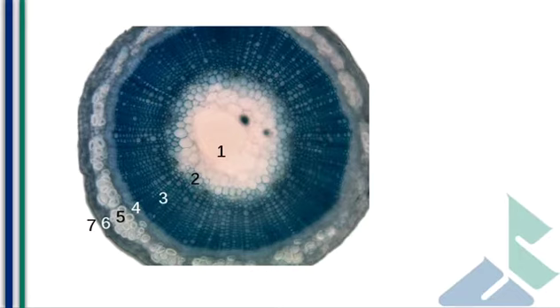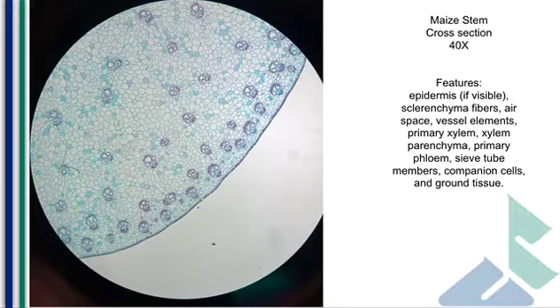Now, in the lab today, we don't actually ask you to look at a developing plant stem in cross-section, because we're going to look at how this differs in plants that are completely mature. The reason that this maturity difference is important for us today is because we're going to be looking at what these vascular cylinders look like in different monocots and dicots. So let's start by looking at our monocot, maize.